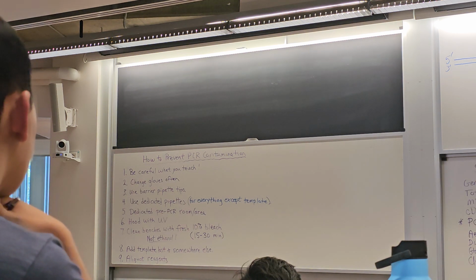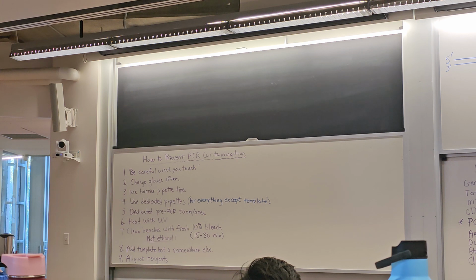If my lab studies PCR, and now I'm going to add template, do I want to do it in my lab? Probably not. That's a bad place, right? It's really contaminated with PCR. If you can, and it's not always possible, take that plate, go to some other space, and add your template there, if you can. Now you're going to say, well, you have your template there, now that space is contaminated, right? And that's true to a certain degree.